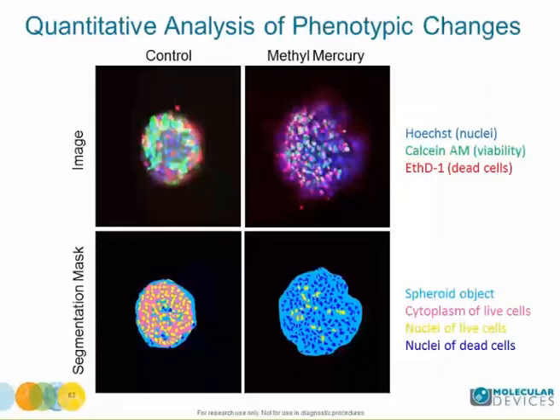Quantitative analysis of images included derivation of parameters to assess morphological features of spheroids, cell content, and complexity. The volume, diameter, and intensities were measured, and also the number of calcein positive cells, live, or the number of ethidium homodimer positive cells, dead, and also average volumes and intensity of cells showing these markers.